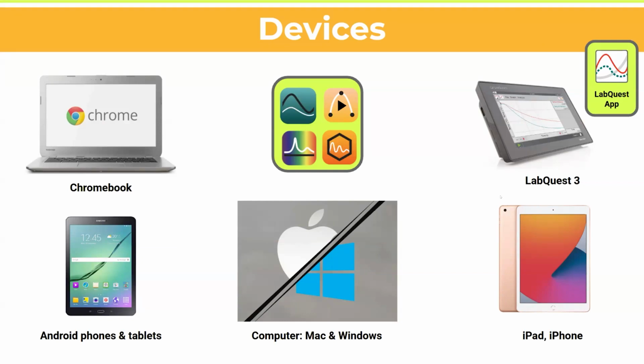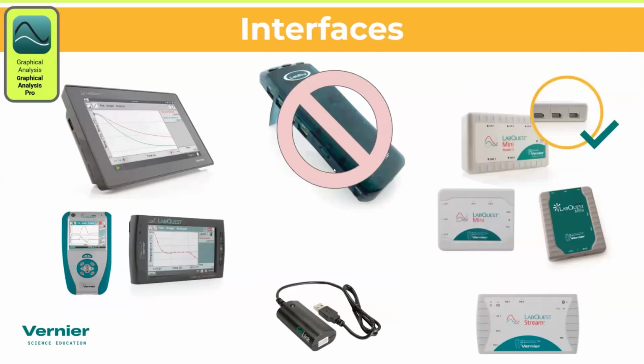Of course, LabQuest 3 still exists with its own built-in LabQuest app. It does not run the analysis apps, but you still have full functionality with your sensors and things with a LabQuest 3, separate from these other apps, but we're focusing today on these analysis apps.